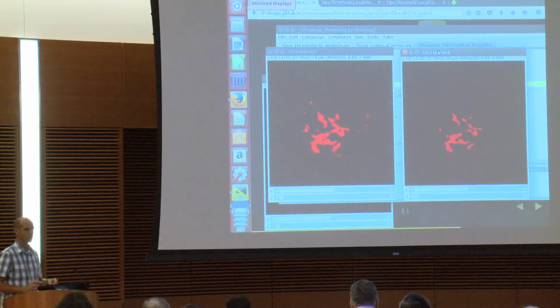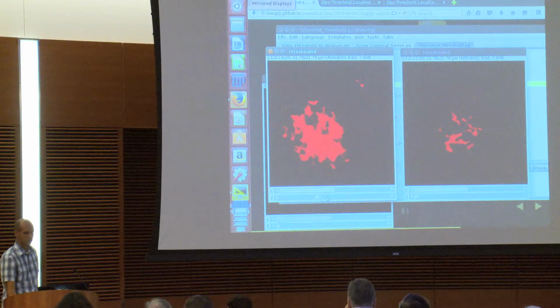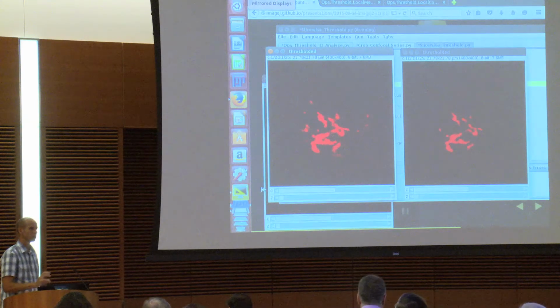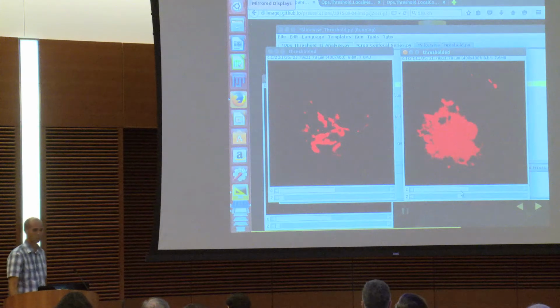So you got a different threshold. In the first case, each slice has its own threshold, so it's going to threshold more pixels from each slice, because it's not considering the entire range of values in the volume. This time, it used the entire volume, so you get a different result.